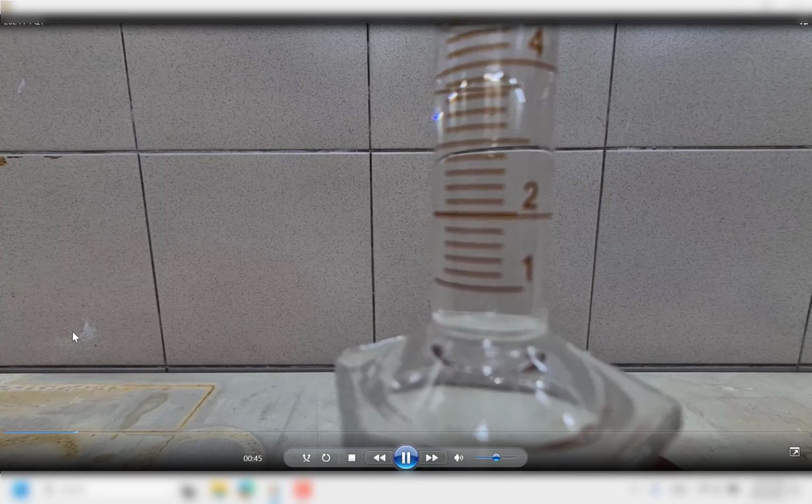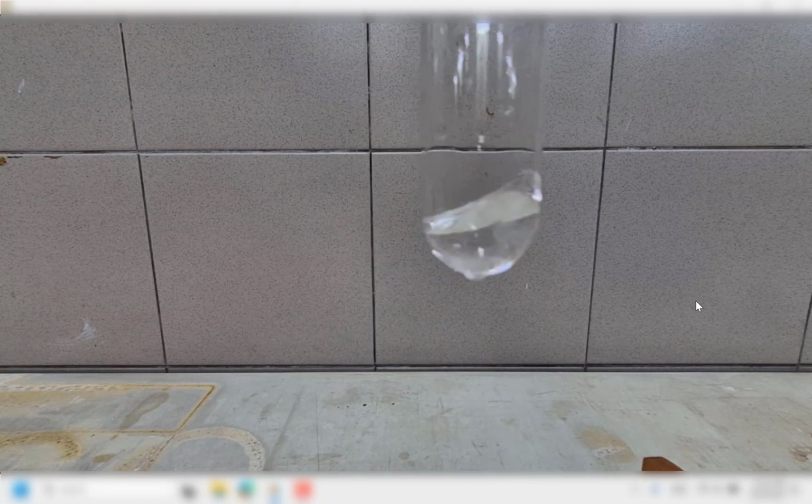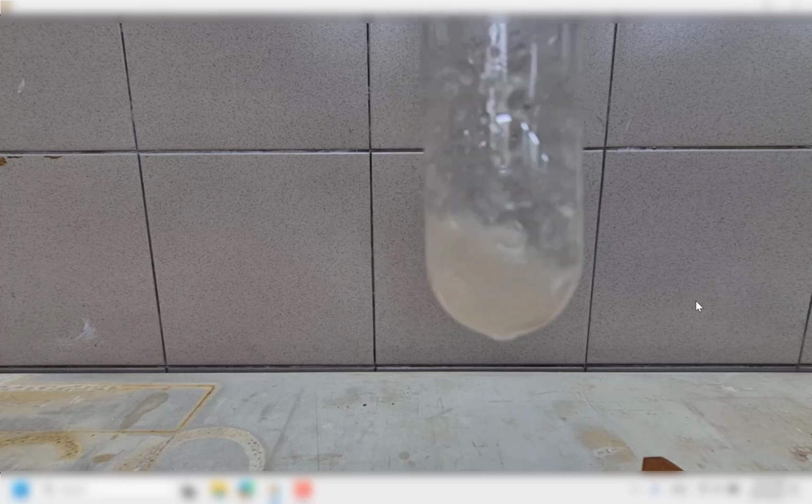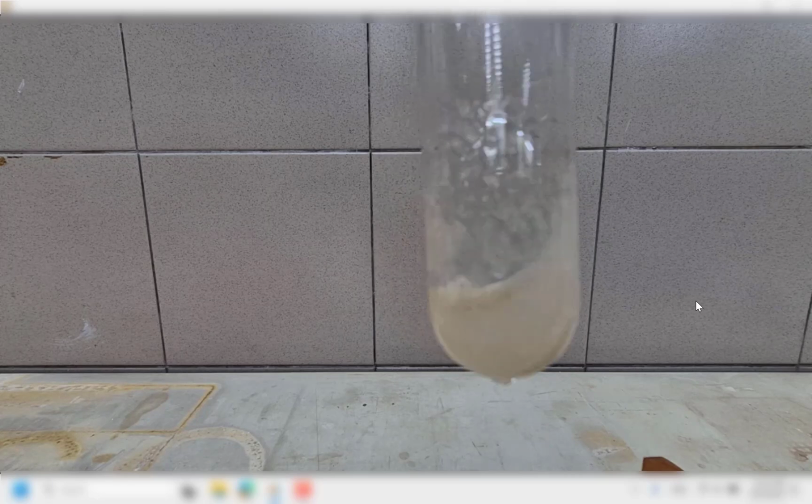Slowly add in, and please check the addition again at this point. You see an instantaneous appearance of white, and then after that it quickly turns brown. The white remains for slightly less than 5 seconds, and then take note of the wall of the test tubes.